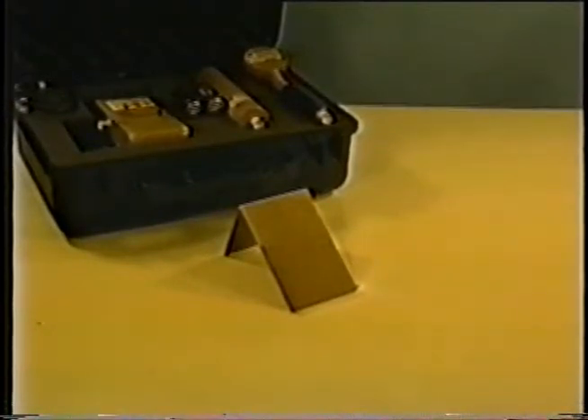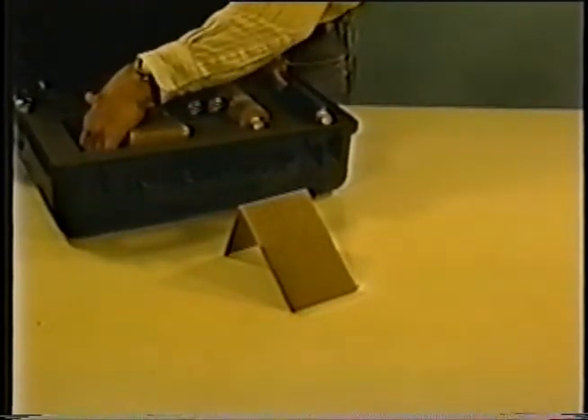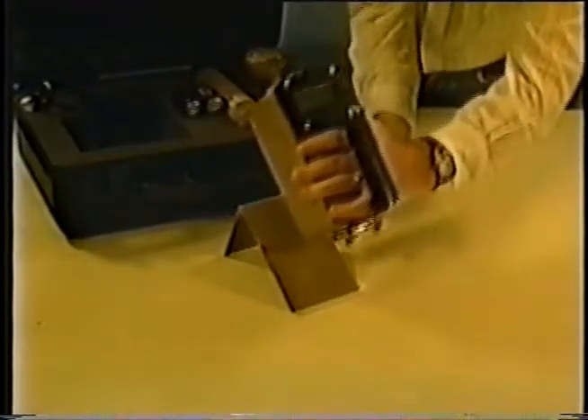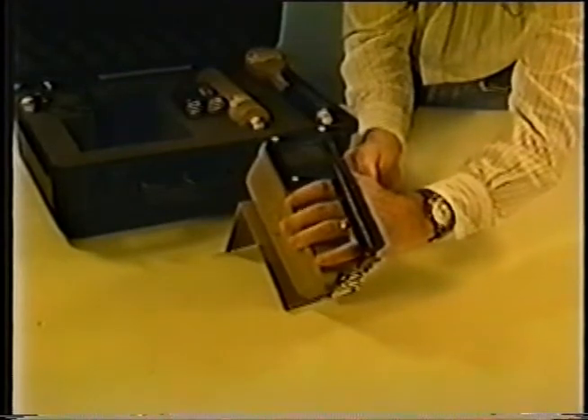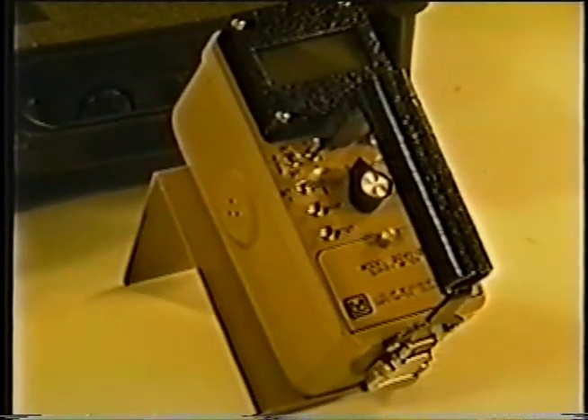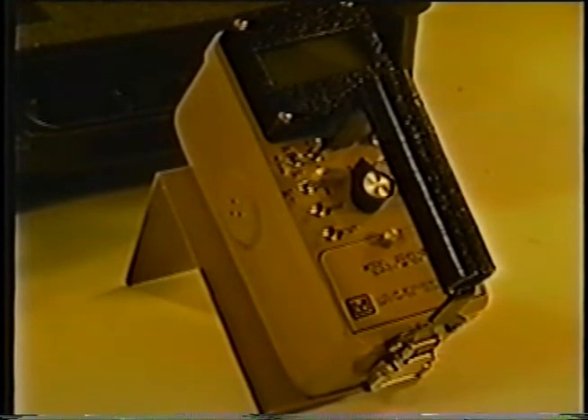The 2241-2 is a microprocessor-based portable digital survey meter. It has programmable parameters for two detectors. These parameters are set at the time of calibration to enable one detector position to display readings in counts registered in a given time, such as counts per minute or counts per second. The other detector position will display readings in exposure rate, such as roentgens per hour. The procedures for changing the parameters are outlined in the owner's manual. Only persons familiar with the procedures should be allowed to change these parameters.